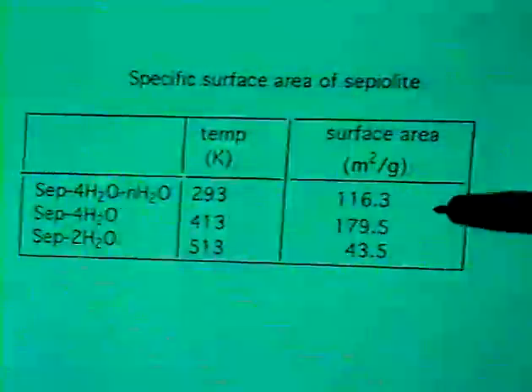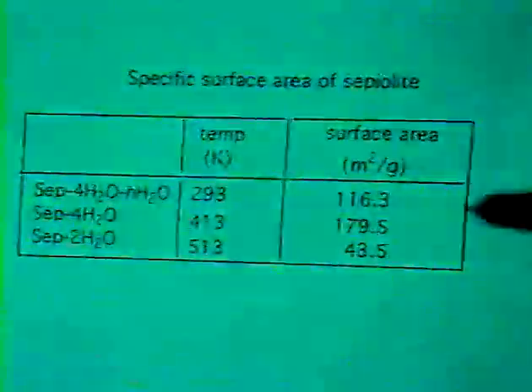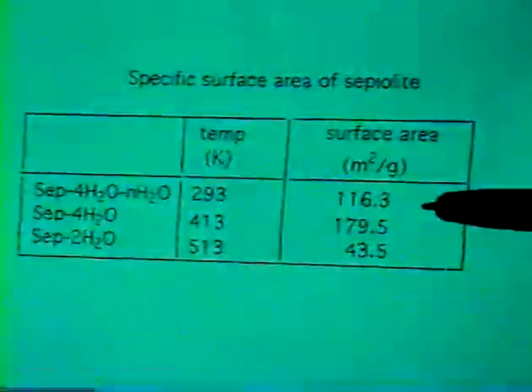This table shows the specific surface area change of sepiolite by heat.